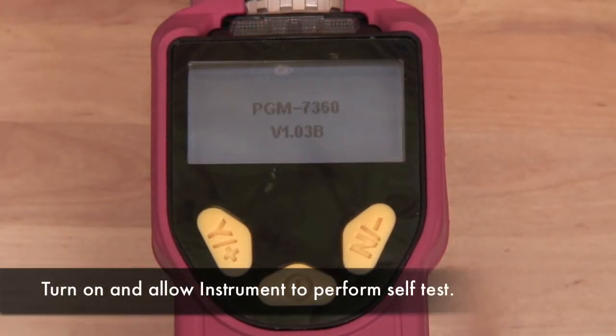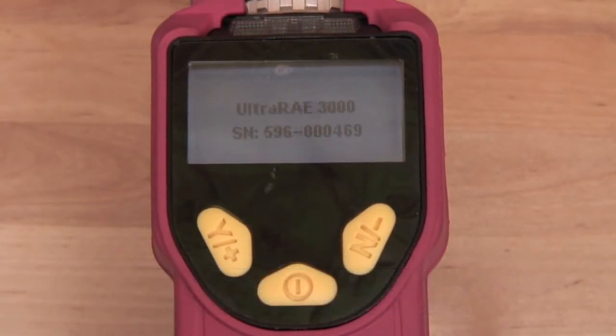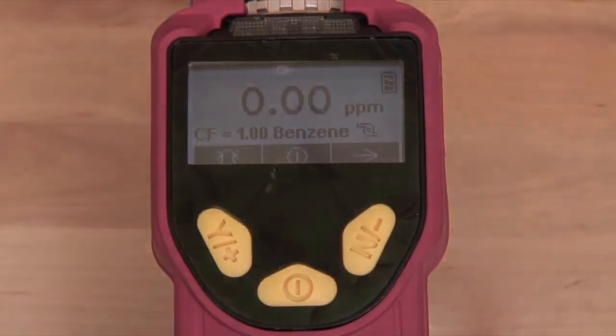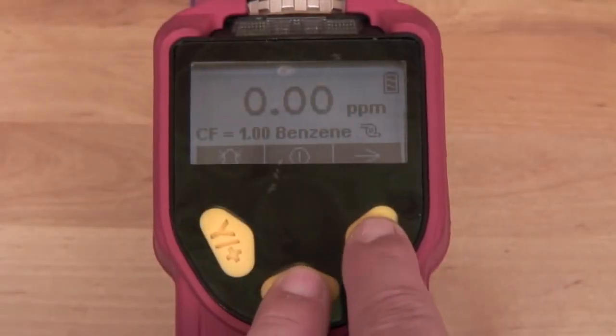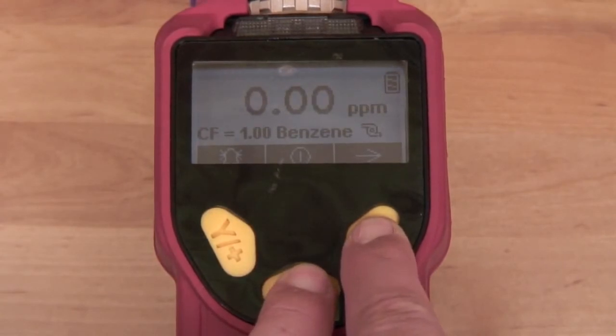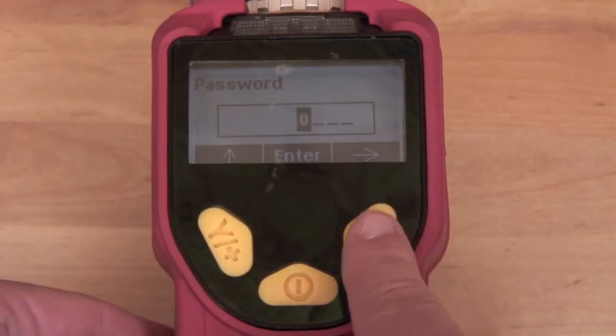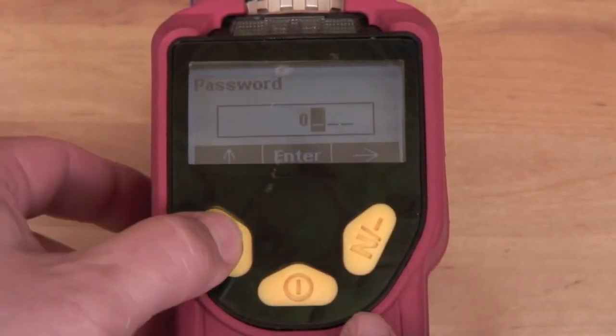Turn on the UltraRay 3000 and allow it to perform a self-test. With the UltraRay 3000 turned on, press and hold the N and Mode keys to enter the programming mode. The default password is 0000.